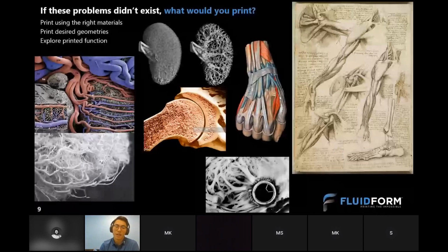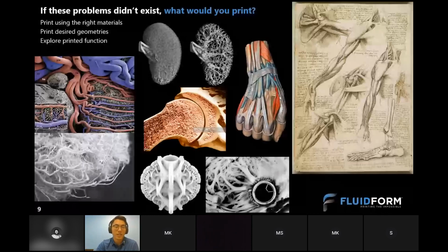And these devices need to have very specific interface geometry as well as functional geometry that needs to be created. And these are very important challenges to tackle. And for the more science fiction addicted researchers in us, we are particularly drawn to designs like these that don't exist in nature but look biomimetic and have potential, for example, more efficient fluid dynamics as an example of the functions that we can create in these geometries.